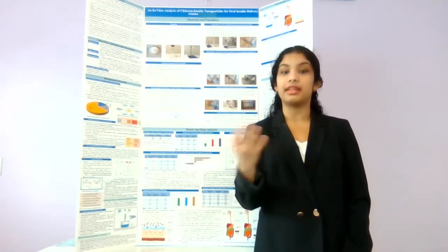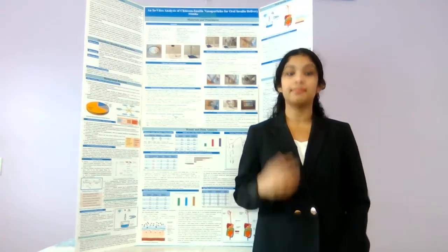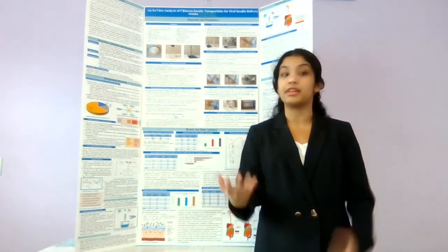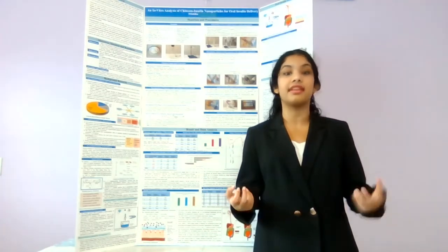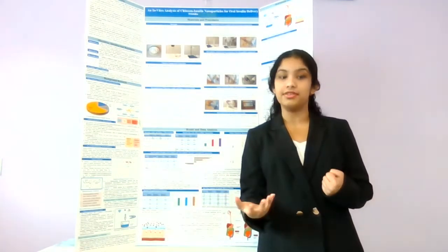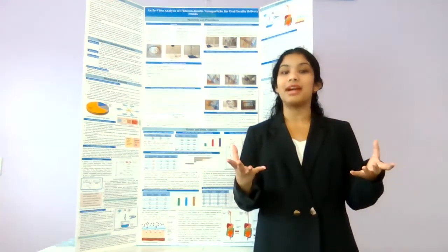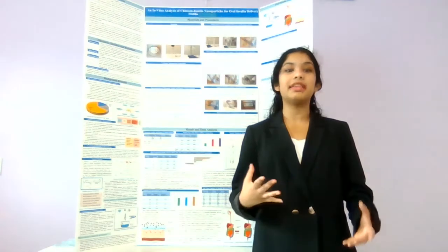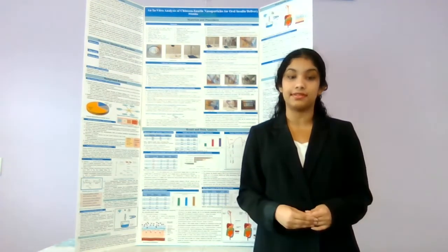In self-assembling the Chitosan-Insulin nanoparticles, I did not use any harsh chemicals. I also determined many of the physicochemical properties of the nanoparticles to determine the best chitosan-insulin weight ratios to be used and how to improve insulin retention and release at the right times in the GI tract based off of simulated pH levels corresponding to those in the digestive system.